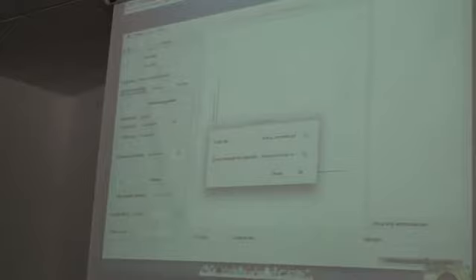Okay, now that we've done that, we're actually going to load the data in. So STAMP takes two things. It takes the profile file, which could be OTUs or functions. It's basically just a table format. And then it also takes what I showed at the very first, this map file that indicates how you can group your samples.